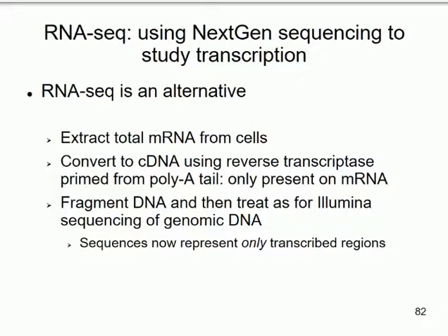So the sequences that you've now got only represent regions of the genome which are transcribed. So anything that's not been converted into message won't be part of your sequence information. You're just looking at what corresponds to the RNA. And this is called RNA-seq, RNA sequencing.